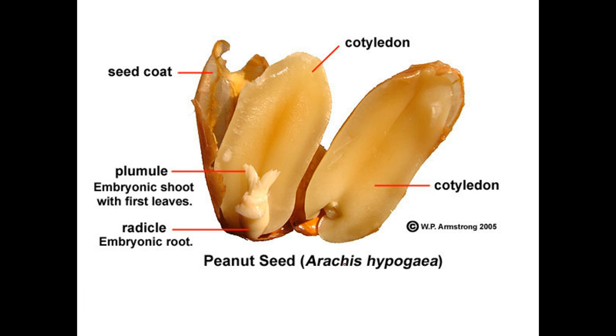Now that you've had a minute to label everything, that very top line in your label on 115, so this area, that's the stored food supply. So when thinking about peanut butter, it had lipids, it had carbohydrates, and it had proteins. This stored food supply has all of that. And as the name suggests, it's a food supply. It's meant to supply nutrients to this growing seedling.